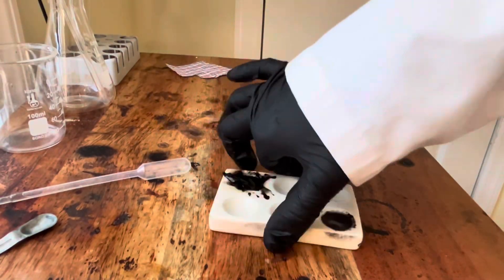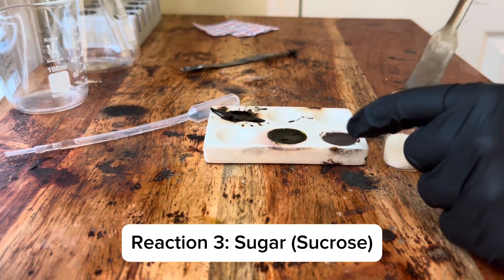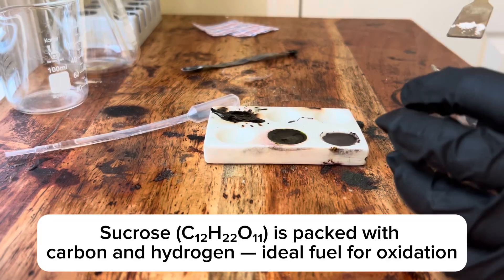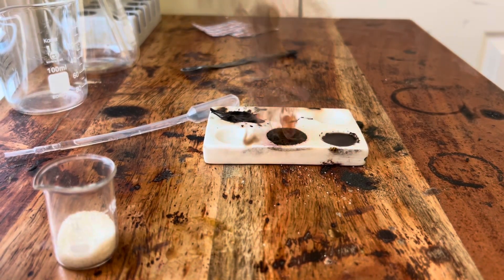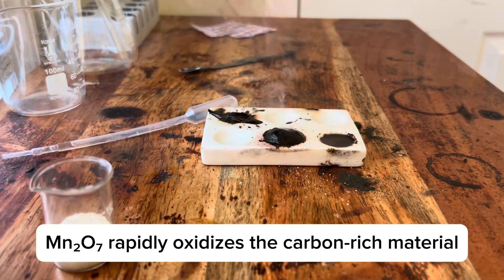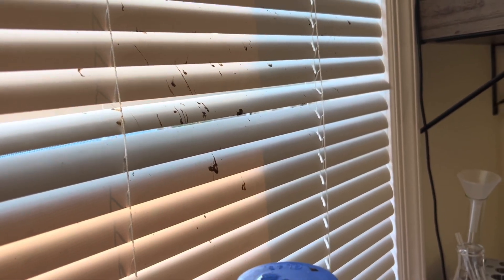Now I have one more reaction that I'm curious to see. You can see manganese dioxide floating around. And wait for it.